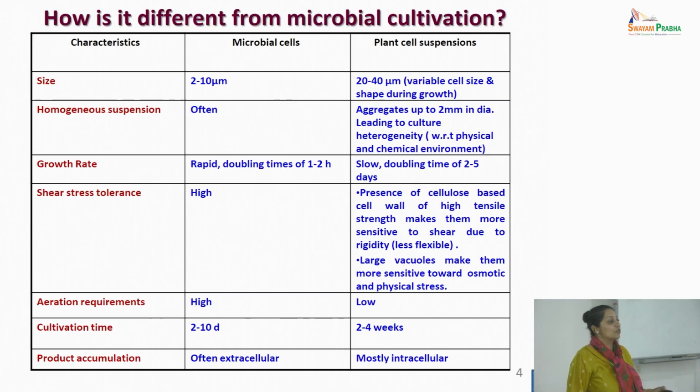The ease has to be looked into, because once you have finalized the process at the lab scale and pre-pilot scale, you cannot keep changing. Everything has to be designed keeping in mind that you are going to have it at the production scale.